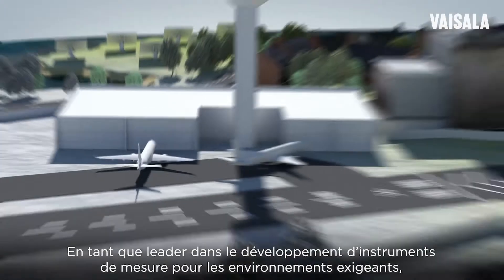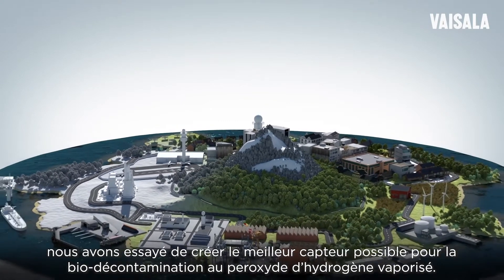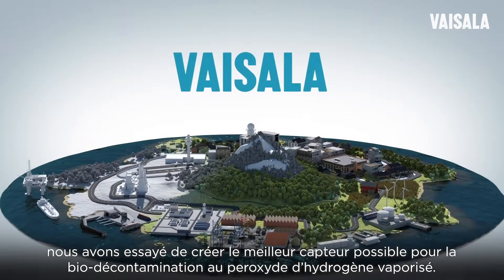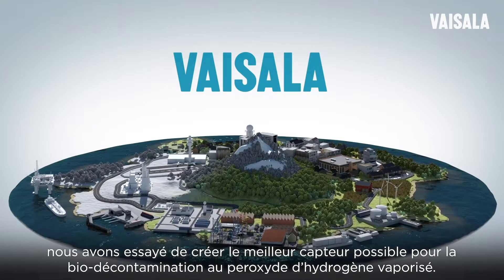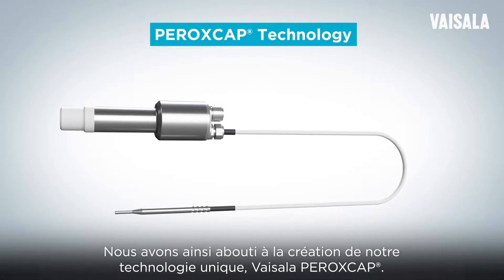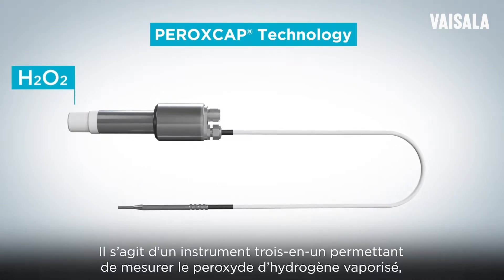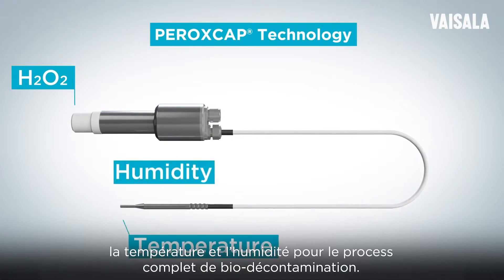As a leading developer of measurement instruments for demanding environments, we set out to create the best possible sensor for vaporized hydrogen peroxide biodecontamination. The result is our unique Vaisala Peroxcap technology — a three-in-one instrument for measuring vaporized hydrogen peroxide, temperature, and humidity for the entire biodecontamination process.